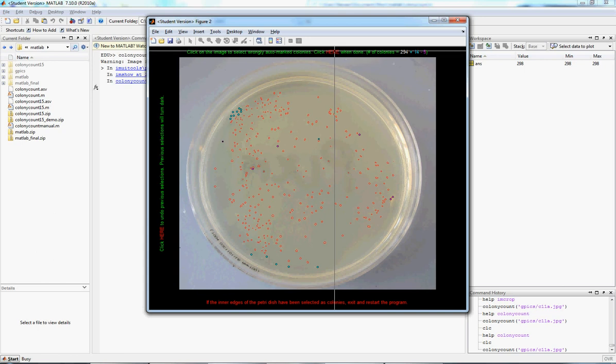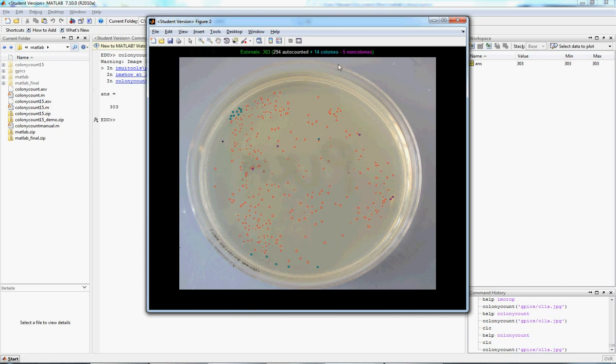So that should be good. Click here. And it gives you a nice readout of the total estimate, including whatever you've added and subtracted. And yeah, that's just about it.